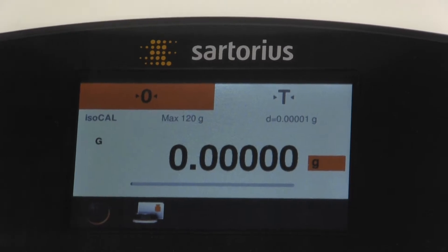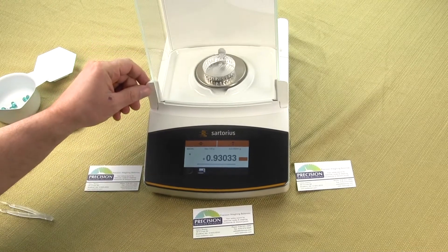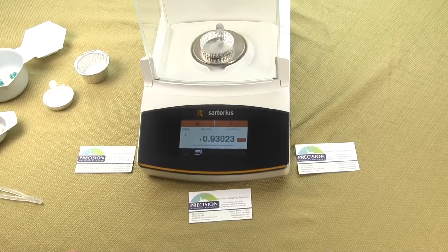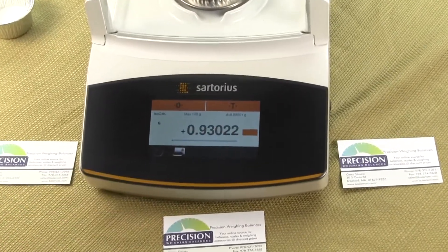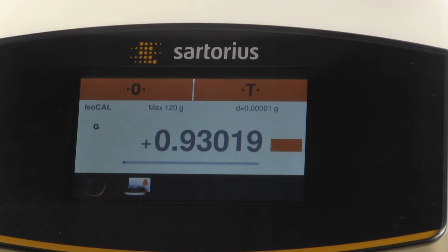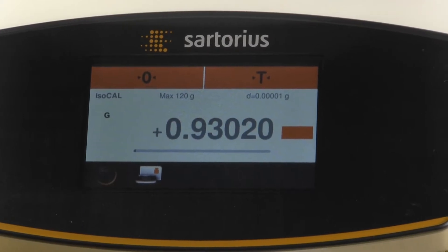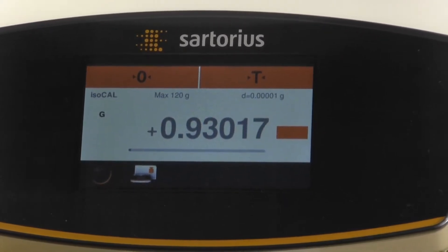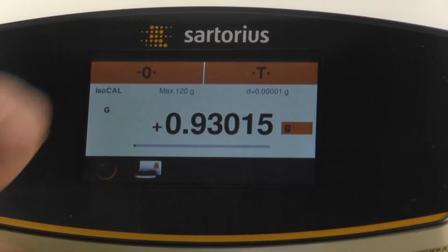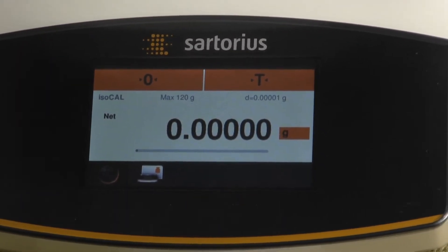We're going to place a container on the platform — we'll use an aluminum weigh dish. You'll notice this is a five decimal place balance, so it takes a little bit of time to stabilize. The display is a light gray and then it turns to a bold black, and that's when we receive a stable reading. Once we have a stable reading, we're going to press the tare button to tare out the container. Tare subtracts the weight of the aluminum disposable dish.